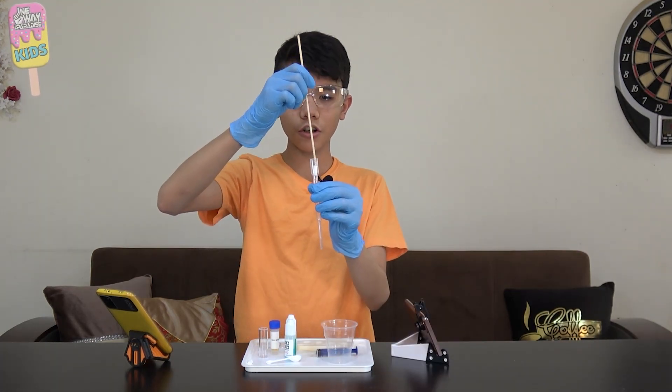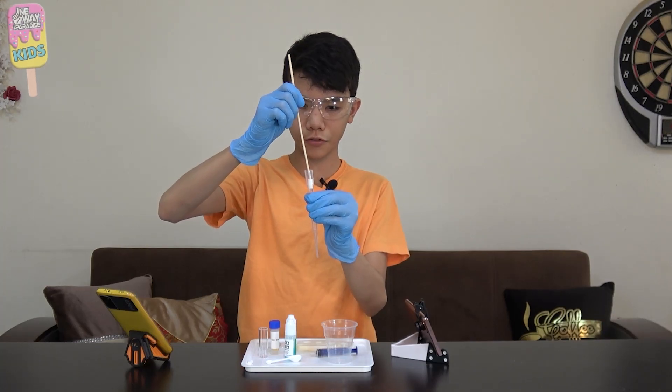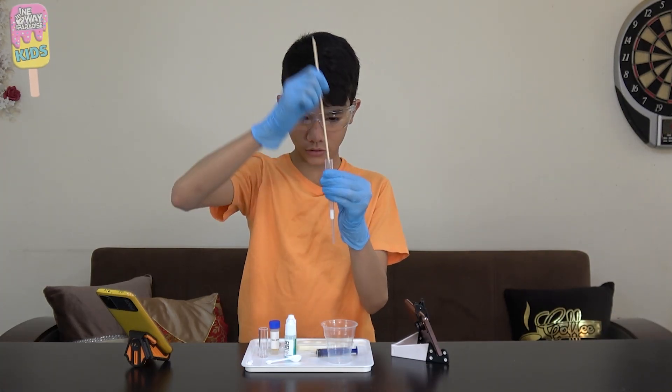We will first start off by putting a cotton cylinder inside of our filter body, just like so.